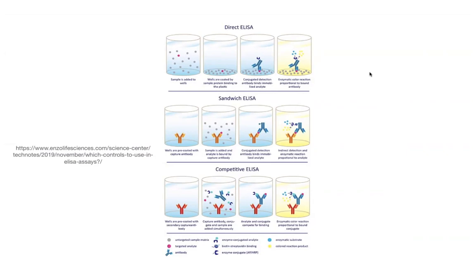So it differs from a Western blot in that this is taking place in the wells of a dish, rather than on a membrane, and you don't have to separate things first. But one of the downsides is that you're not seeing anything about the size of the things. And if we think back to that Western blot with all those non-specific bands, well, now if you see a signal in your ELISA, is it really coming from the protein you think it is?